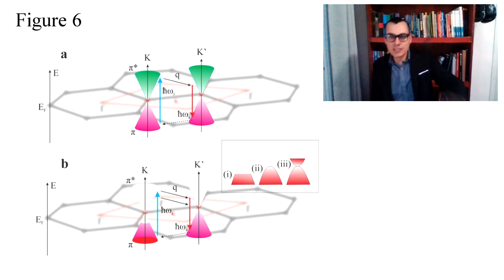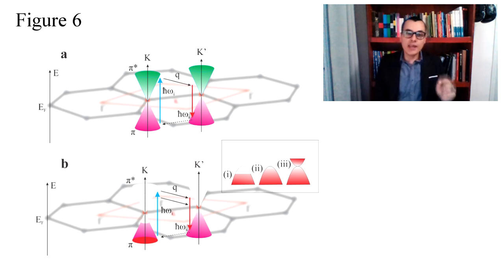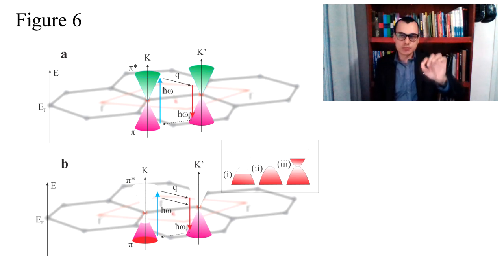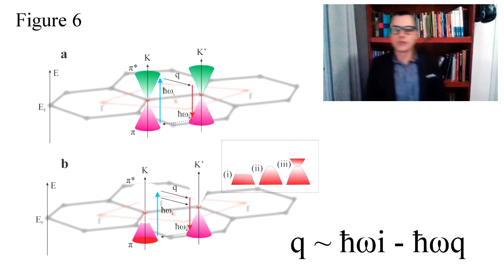On this occasion, they showed that the D band shifts according to the frequency change of the incident photon energy. They proposed that the modulus of the phonon wave vector associated with the energy of the output photon is represented by the equation in this figure. Look at this equation here.